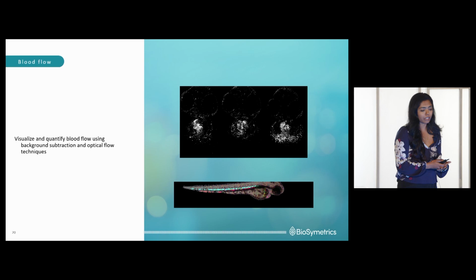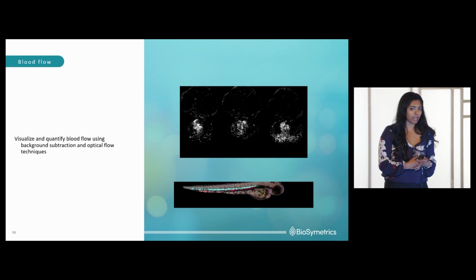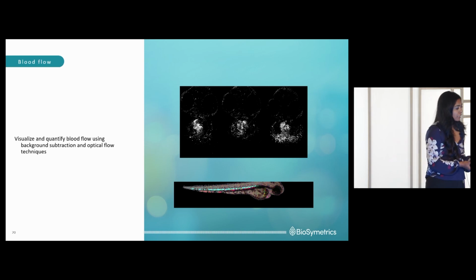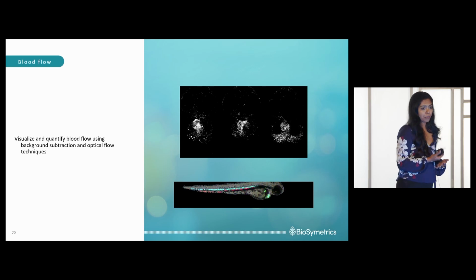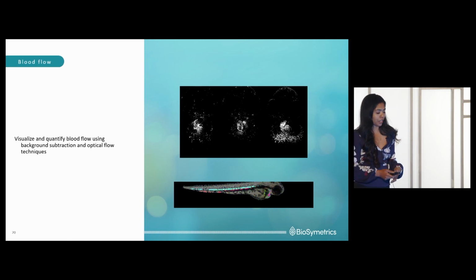So this is where you can take the zebrafish. In this specific example, it was a zebrafish mask. You can also take the notochord, myotome, whatever you're interested in, and then look at circulation that way as well. And this specific video looks at using optical flow to false colorize the flow in general.